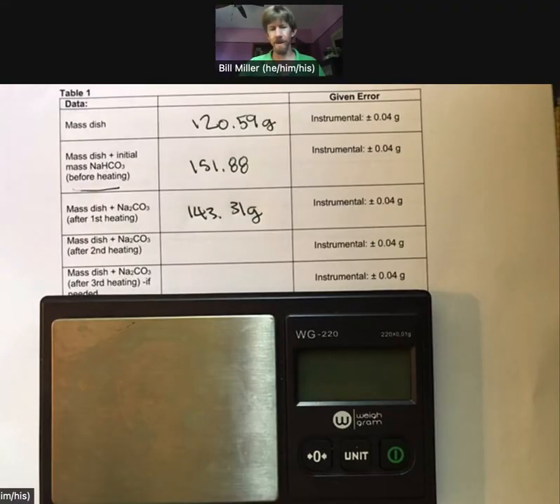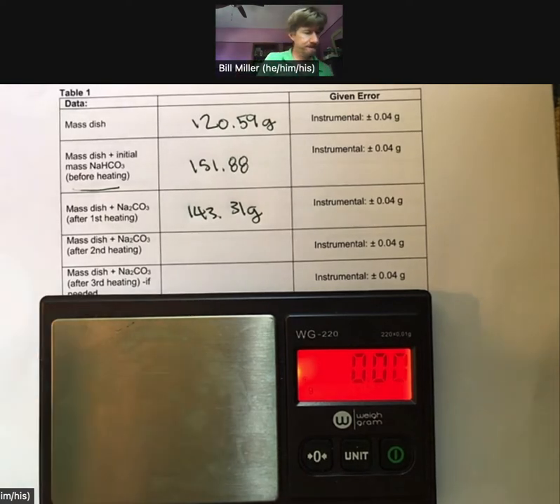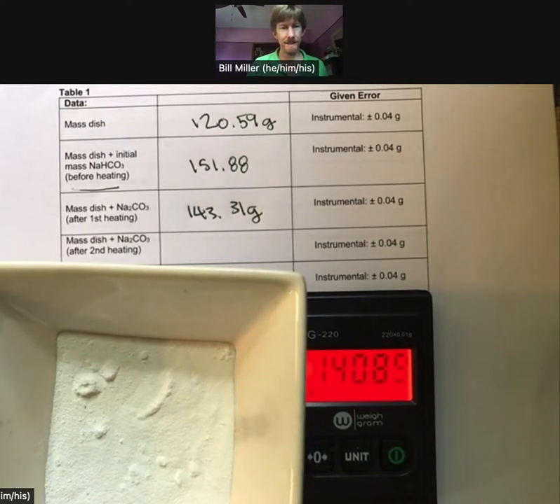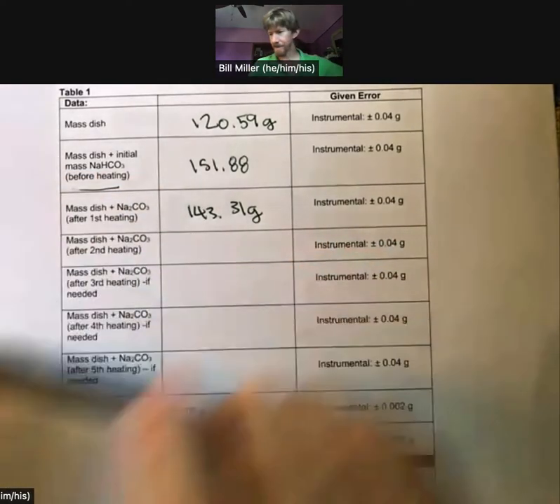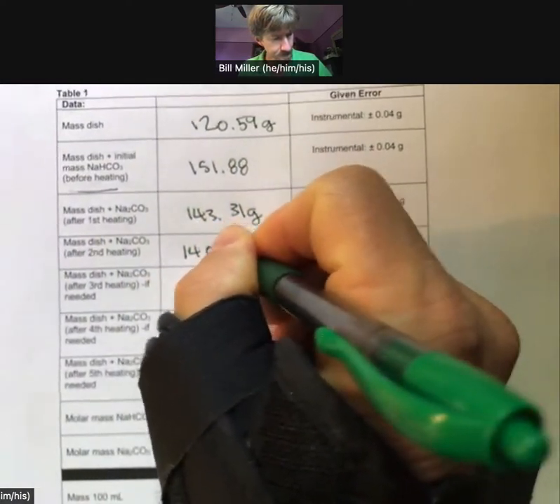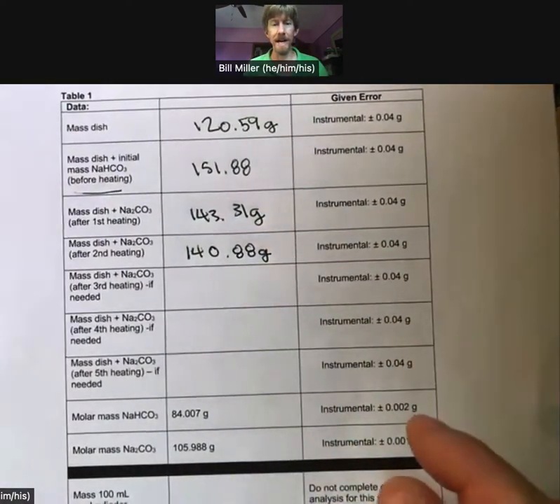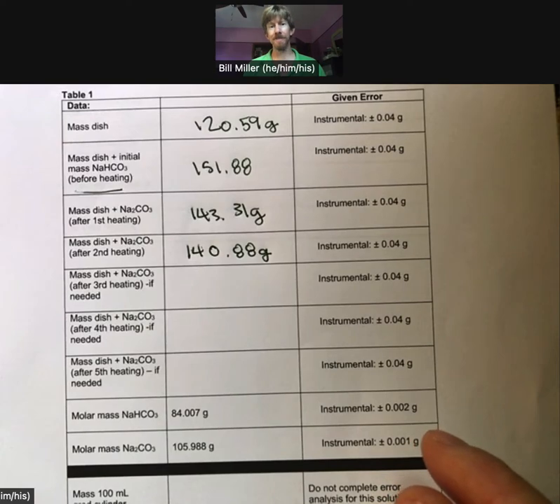All right, let's come back for another measurement. So this time it has been 30 minutes in the already preheated oven. We have 140.88 grams. And so the difference between these two is not 0.05 or less. So put it back in the oven for 30 more minutes. Let's see what happens next.